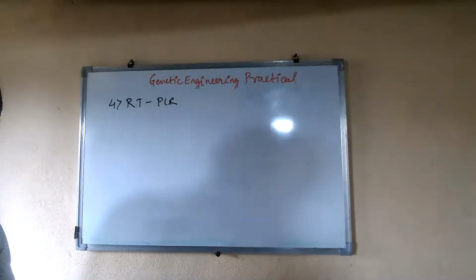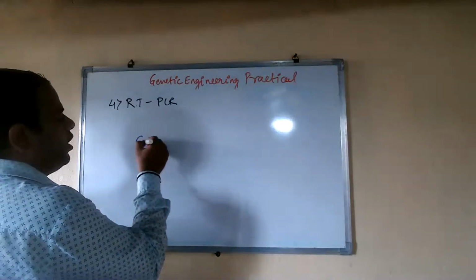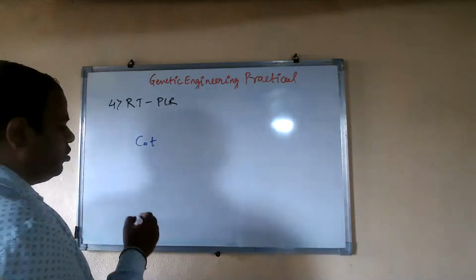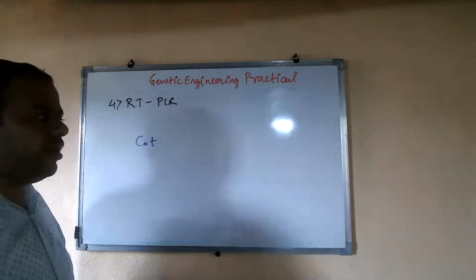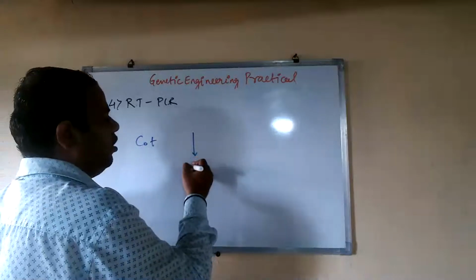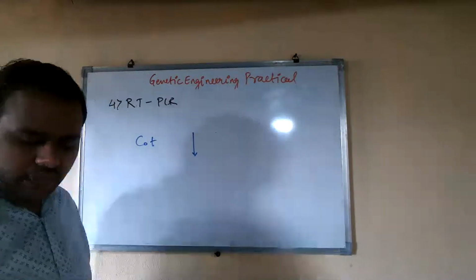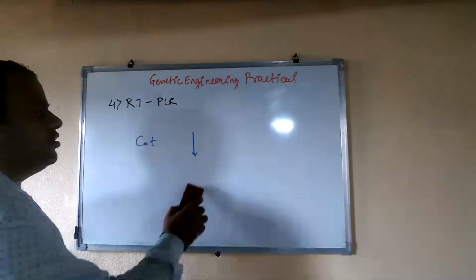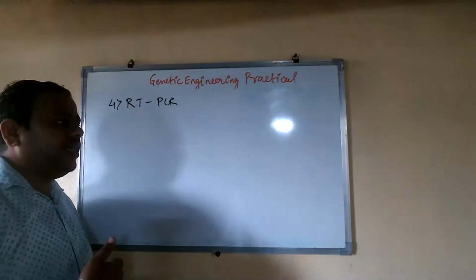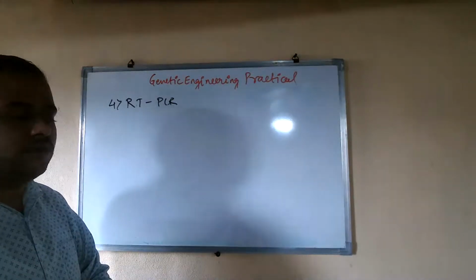Okay. So one particular thing here that I want to tell you is the CT value. Remember, if the concentration of the virus is higher, then in RT-PCR you can detect the virus more easily in just a few cycles. And if the viral sample is present in a very low amount in the human sample or the eukaryotic cell, then the virus is detected at a much later stage. Okay, so thereby you can detect the viral RNA using RT-PCR.